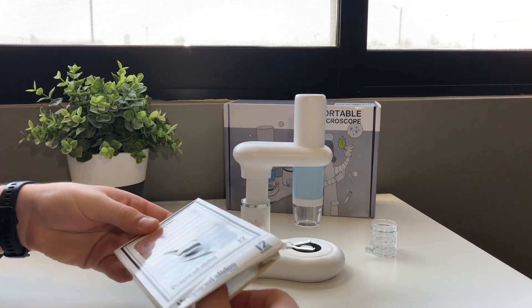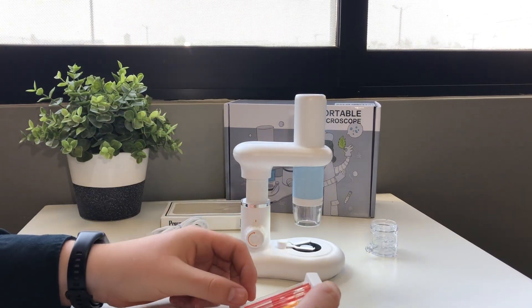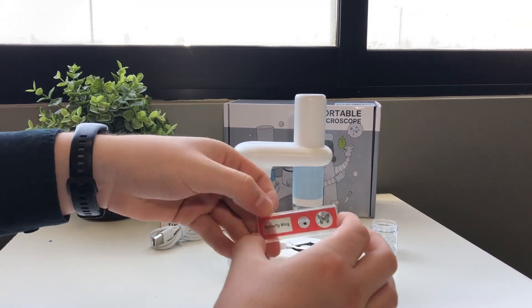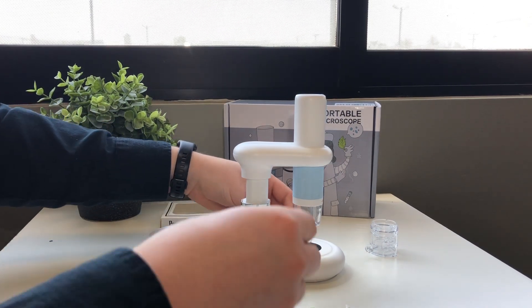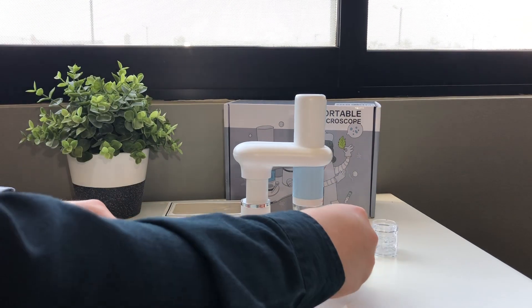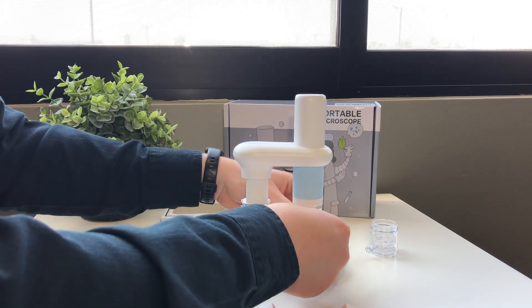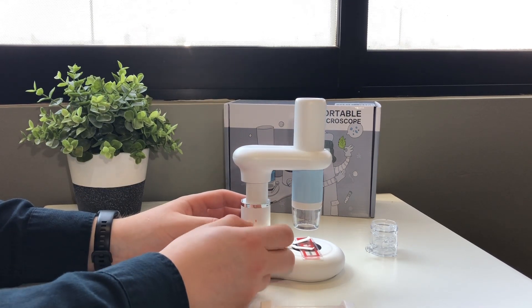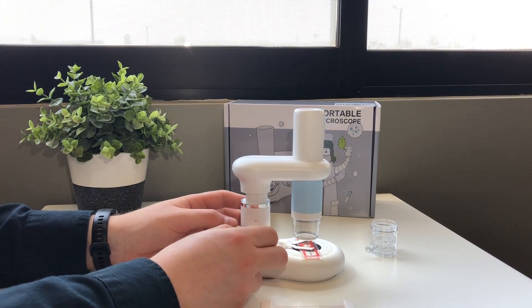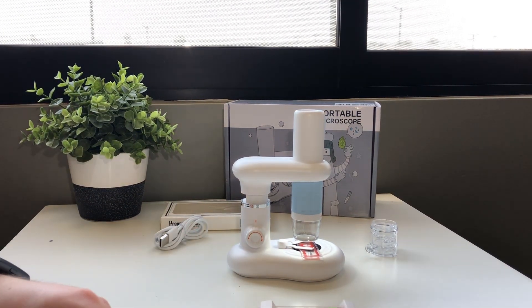We open the box. As you can see, we have 12 samples. We'll go with this one — the butterfly wings. As the microscope is up, we can just get it. Let's get these magnetic holders, center the best we can, and put them back up so it's ready. Make sure everything is working and we can get it close. Now, in our app, as we are going to show you right now, this is how it looks.